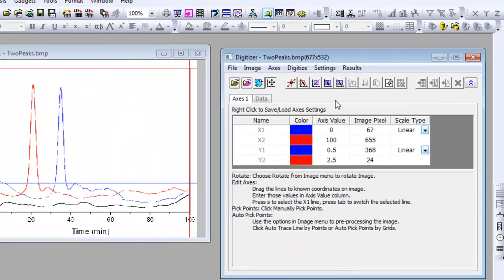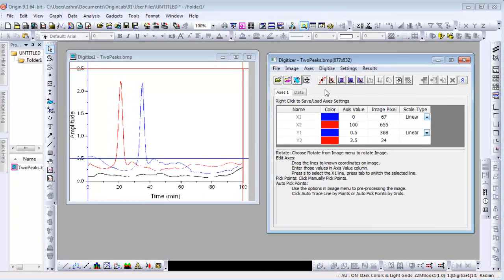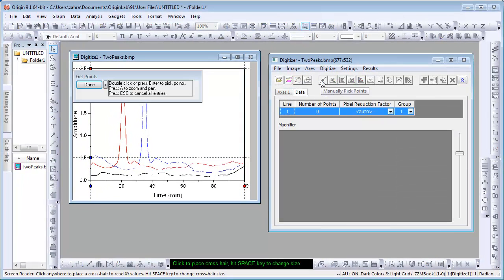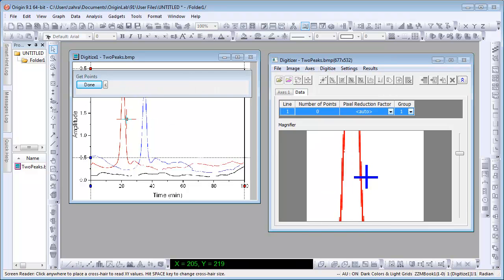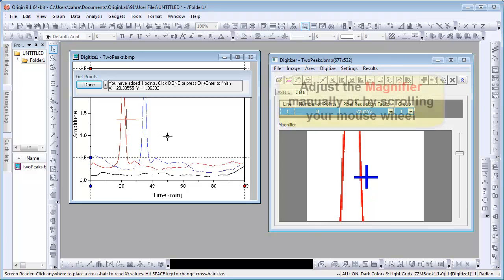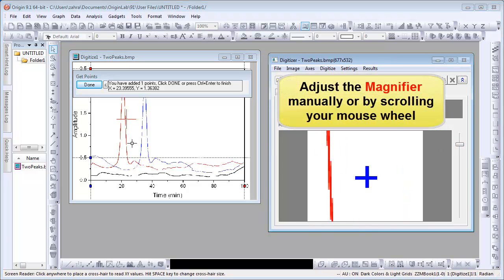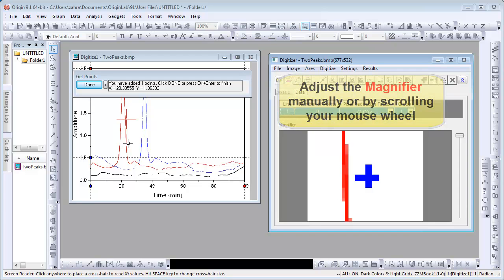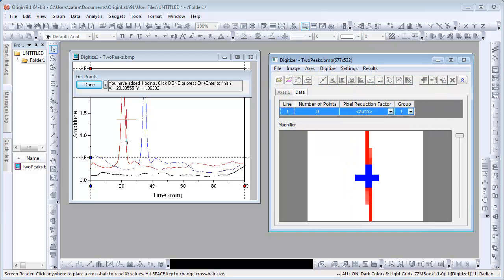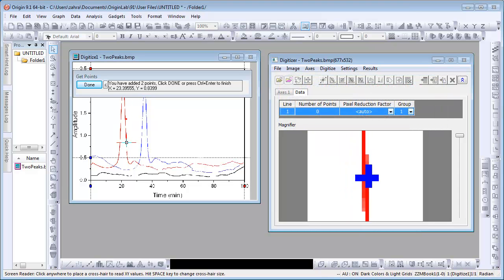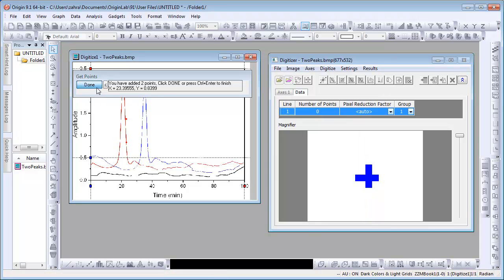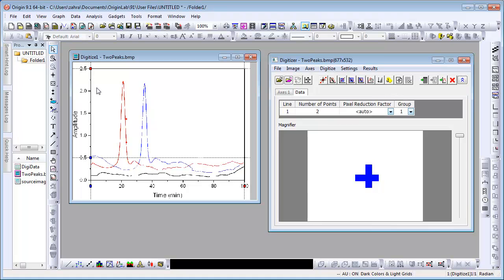We will now use the Manually Pick Points method to digitize the red curve. Click on the button and hover your cursor above the curve. A magnifier will appear in the Data tab with a blown-up view of the cursor in the curve. Double-click to select a point. The magnifier can be adjusted manually or by scrolling the mouse wheel. Align your cursor and double-click to select another point. We have now picked two points as will be shown in this box as well as on the Data tab.